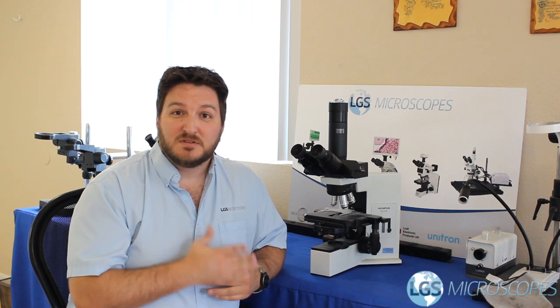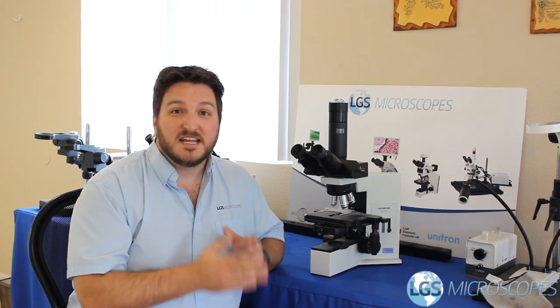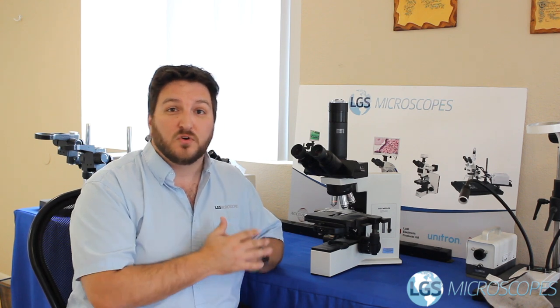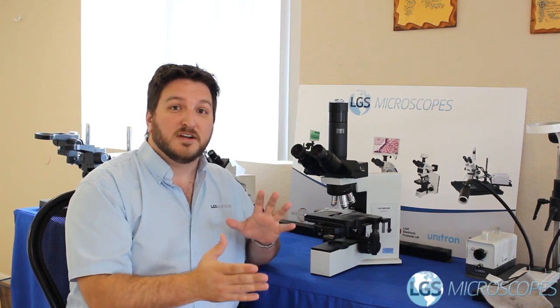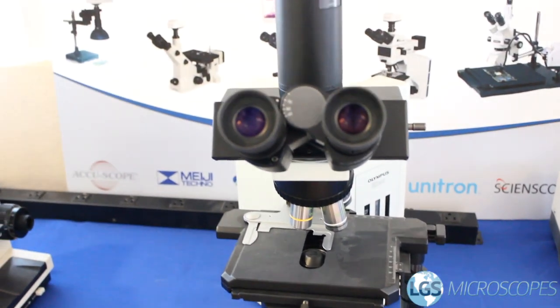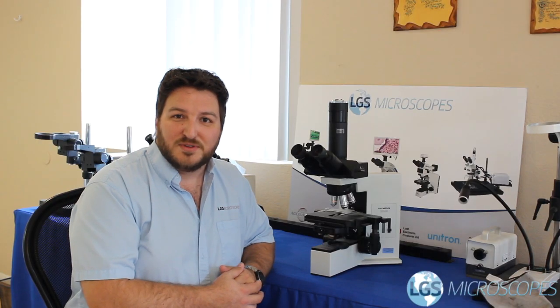Hi, welcome back to LGS Microscopes. My name is Paul and today we're going to be going over the basic day-to-day cleaning that you can do on your own microscope to keep it in top working order in between those visits from your professional. We have a microscope here that's been sitting for a while so it needs a good cleanup. I'll go ahead and show you how to do that.